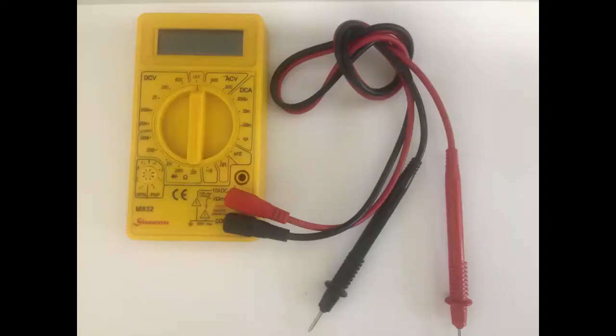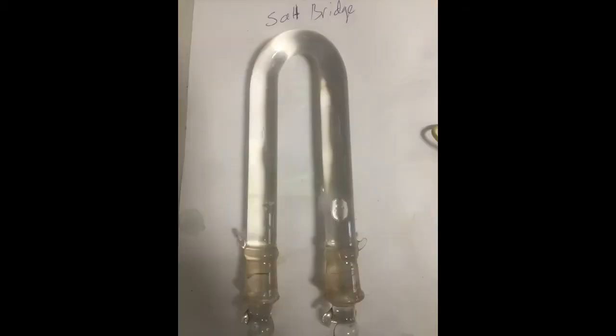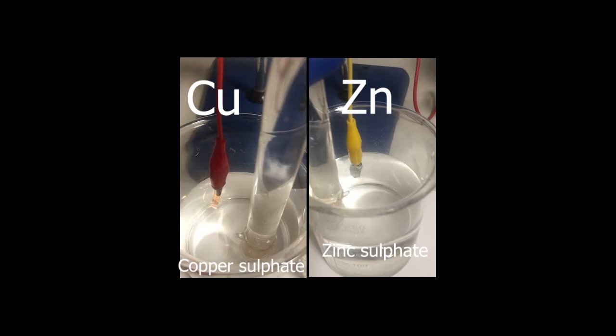Now let's see the redox reaction between zinc and copper metal. First of all, I need some materials: one digital multimeter for measuring potential, two copper and zinc sheets, salt bridge, zinc sulfate solution and copper sulfate solution 0.5 molar.